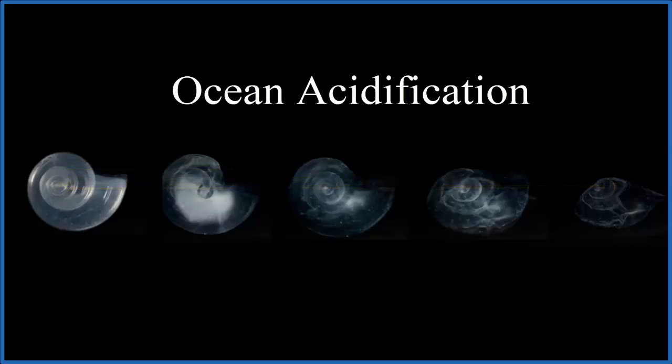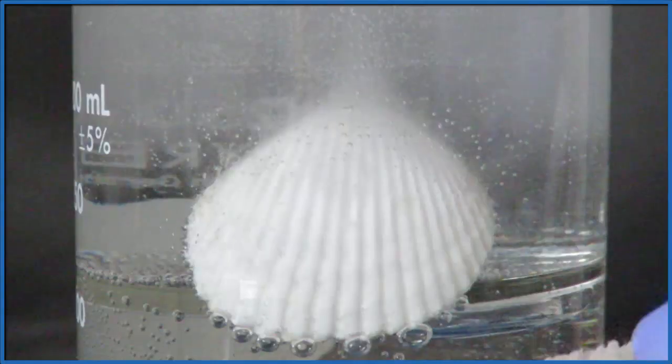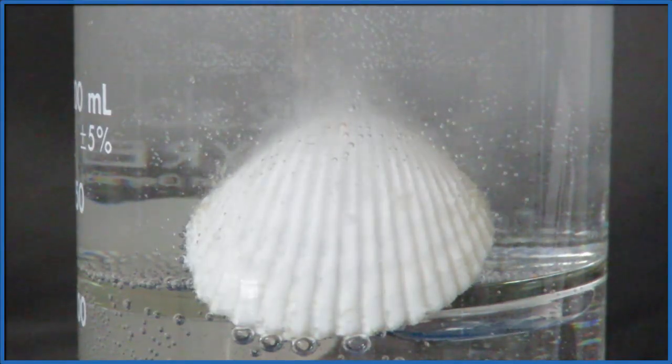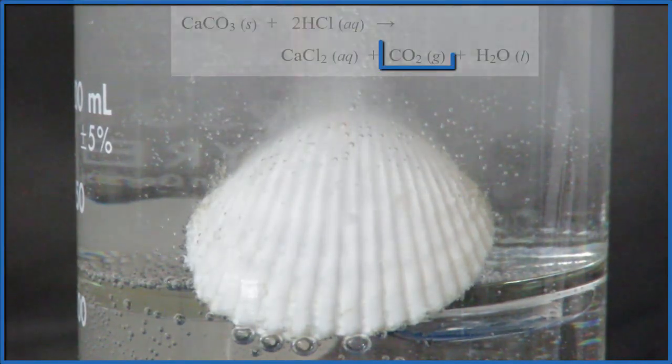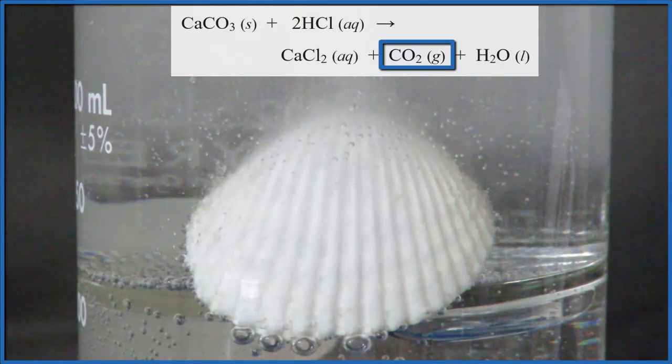So watch what happens when I take a shell, a seashell, and I put some hydrochloric acid on. Again, this is stronger than what would happen with ocean acidification, but you can see those bubbles, that's the carbon dioxide gas we saw earlier.